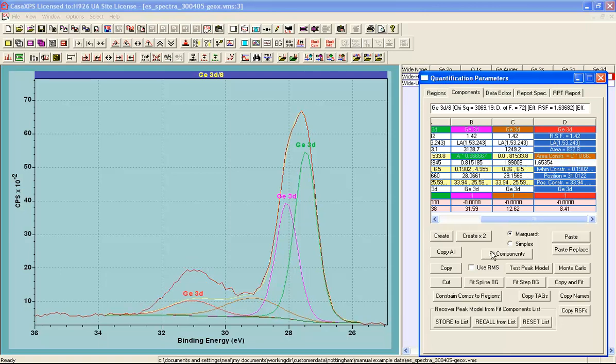And then applying the fit button, we ought to find a similarly adjusted pair of peaks with areas appropriate for a doublet pair. The only problem is that the data and these 4 peaks and a background currently introduces a shape for these oxide peaks which is probably incorrect.